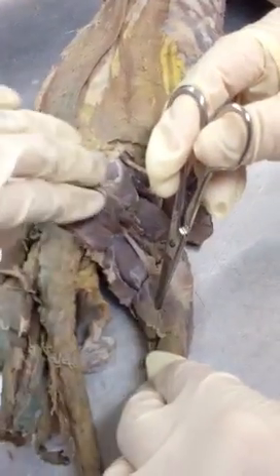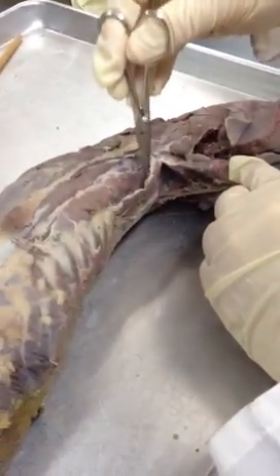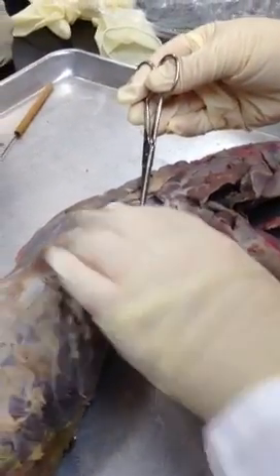On the back side here is gastrocnemius. Tenuissimus and semimembranosus. Up in here, other muscles in the back. This is serratus ventralis, or anterior; serratus dorsalis, or posterior; and sacrospinalis.